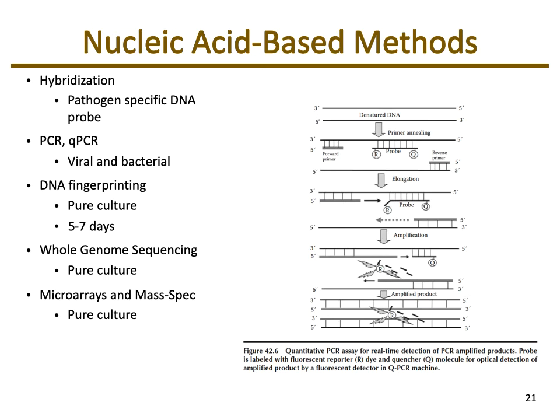With PCR and qPCR, the benefit is that you can do both viral and bacterial. For a lot of these techniques, if we're trying to do any culturing, that's going to be easier to do in bacteria, whereas viruses need a host cell, so you'd have to do tissue culture. With our viruses, you notice I haven't really mentioned them much. You could definitely use some of those immunological-based techniques, but you're limited, and so this is where these PCR, qPCR techniques would be beneficial.